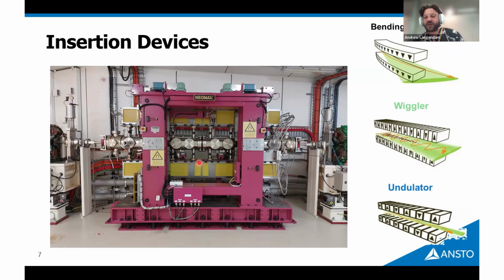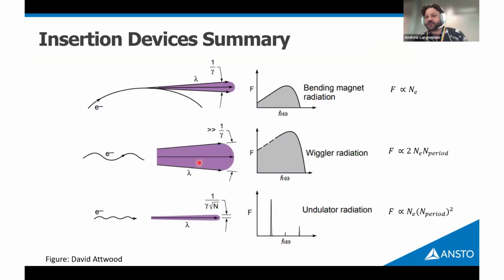And then XFM has a different kind of insertion device, which is called an undulator. And this is very, very similar to a wiggler, where you've got these opposite-poled magnets in periods. But the idea is to restrict the movement of the electron beam so that when you're looking down all of your pipes and trying to look at your source of X-rays, all of the wiggles and wobbles stay within the visible distance of that particular insertion device.